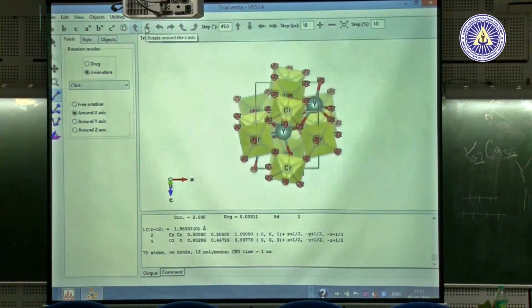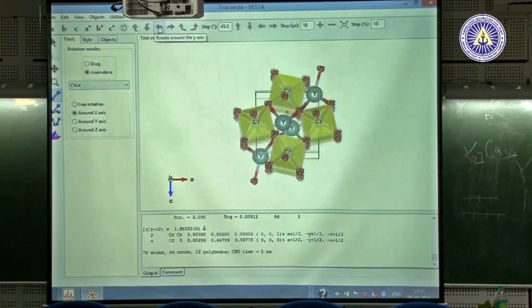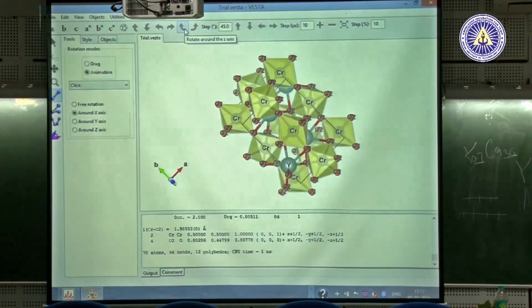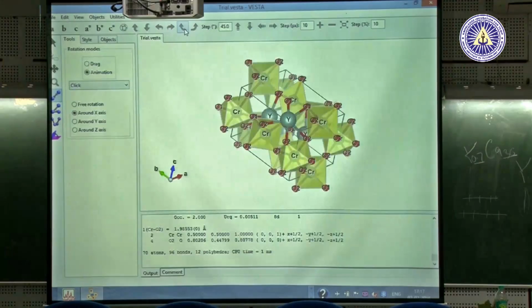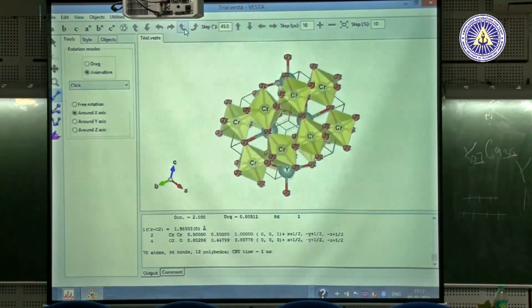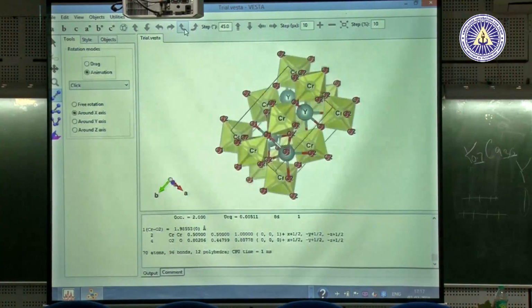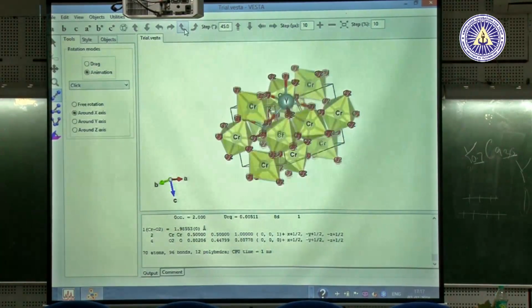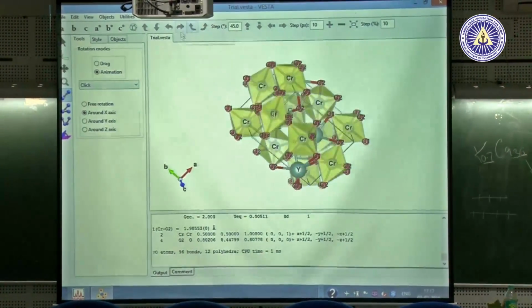It's a good tool we can use even for teaching, isn't it? Like on those lines, I have a very stupid question. If I want to just highlight, say, the interstitial sites, can I do that? If I want to show an octahedral site, FCC, I would work on oxide structures. If there is an octahedral structure and I want to show the coordination, for our undergrads, it's a very good thing.